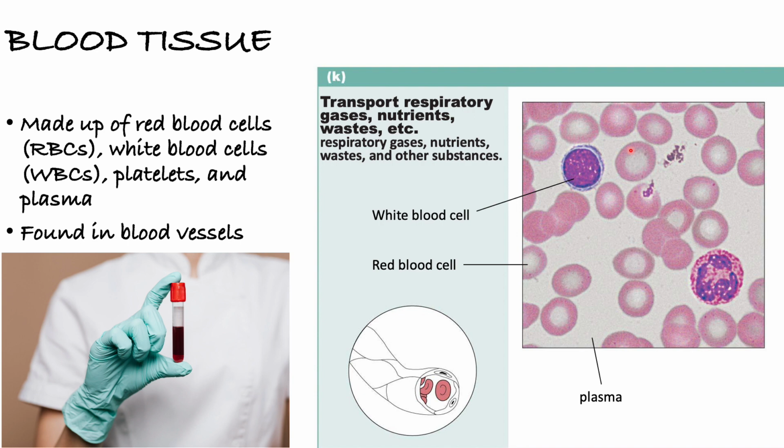One of the things we've seen about a nucleus is that it takes up almost all of the cell. We can see that here with the white blood cell. The nucleus has taken over all of the cell. We cannot have that in a red blood cell. If a red blood cell is going to do a good job, we have to dump the nucleus. Okay, so that's why you see the hollow center in all the red blood cells.